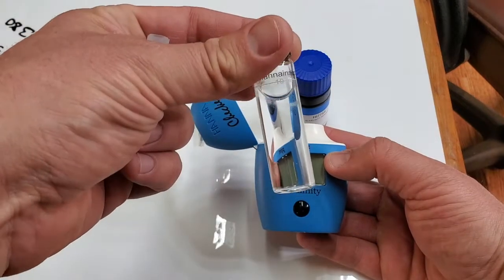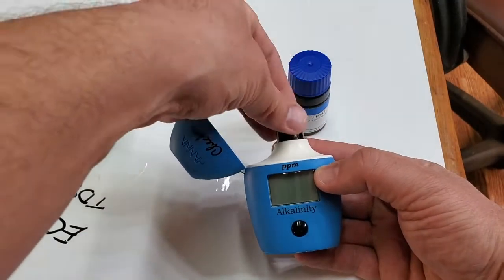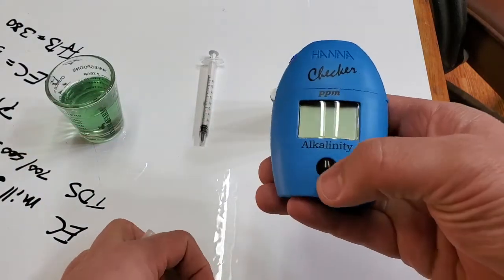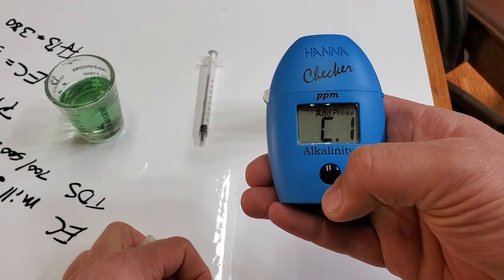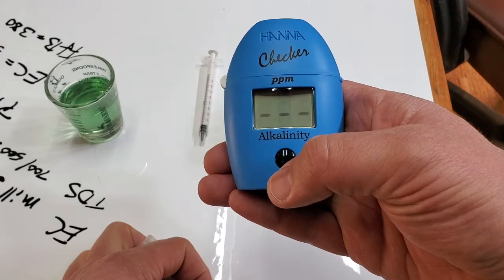Fill your vial with 10 milliliters of your sample. This is water from an RO filter that's on its way out. C1 means put sample one in and let it do its thing.